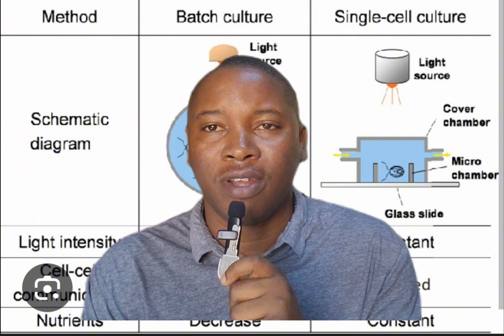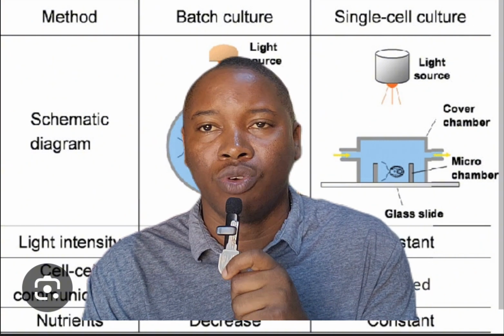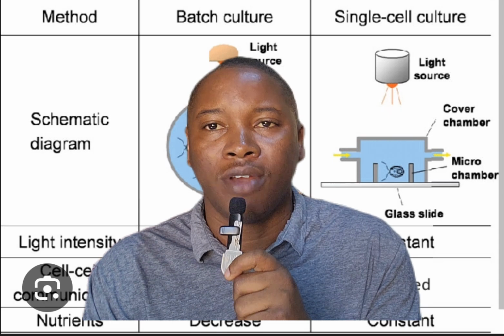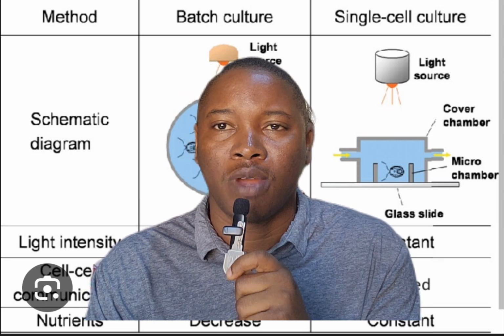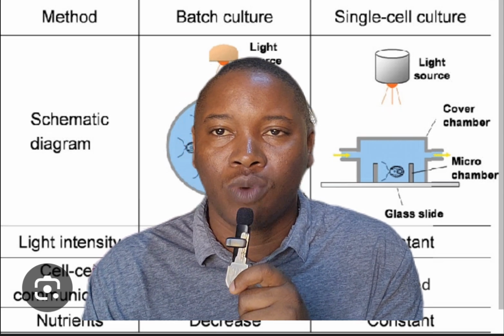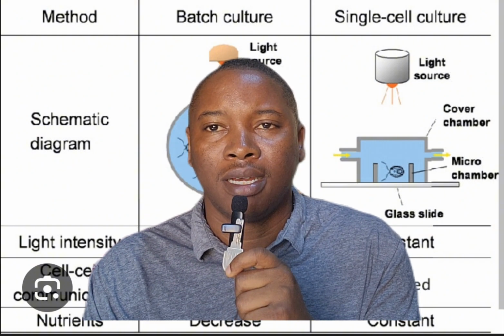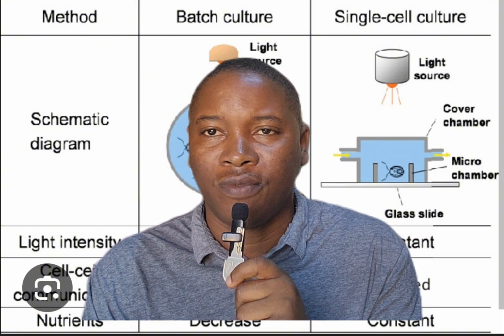You could see that different colonies of the microorganisms begin to grow. You could count these colonies using a colony counter, and then you have the growth of these microorganisms. So this is what we have in a batch culture, and it's what we do in the hospitals, in the research labs, for agriculture, very different places.